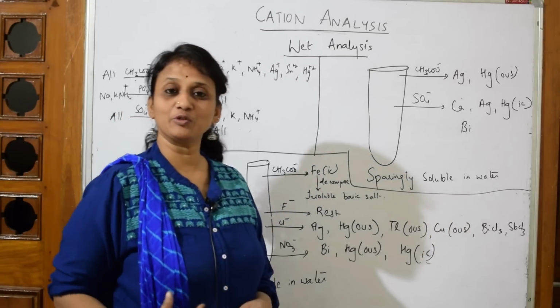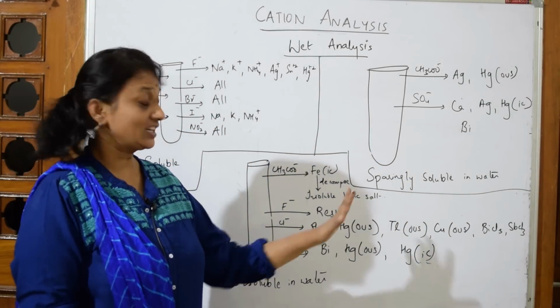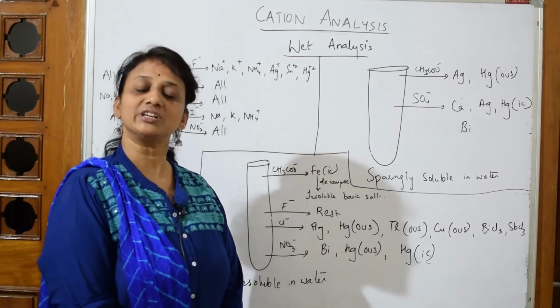Right, so welcome students. Now what did I tell you? I have already given you the basic idea of how to do this. Now let's see the trick. What should you do when you get your cation analysis? I'm going to start with the wet analysis.